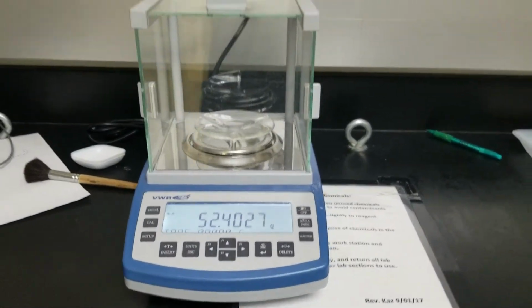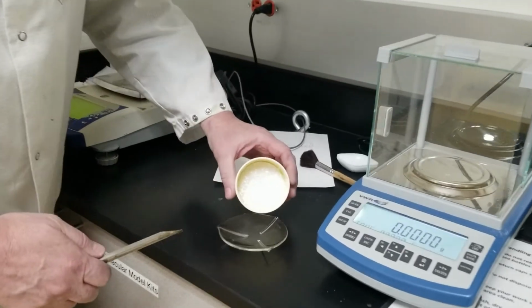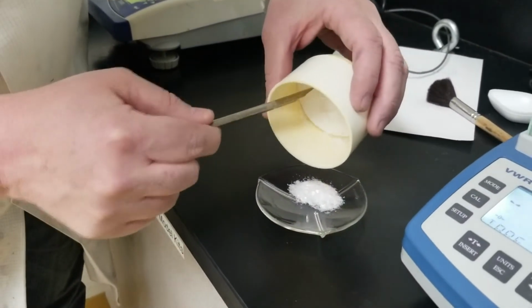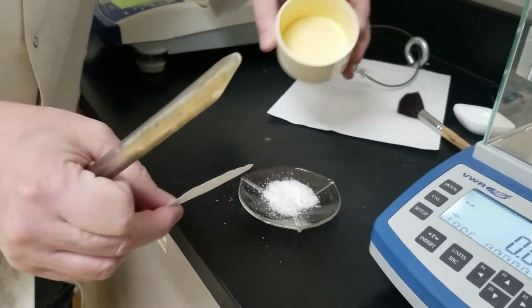Record that weight. And we need to transfer all of our product onto this watch glass and hope it doesn't blow away. We made glitter today. Yes, we did. Ah, it just blew. Yeah, there's some on the bench too.